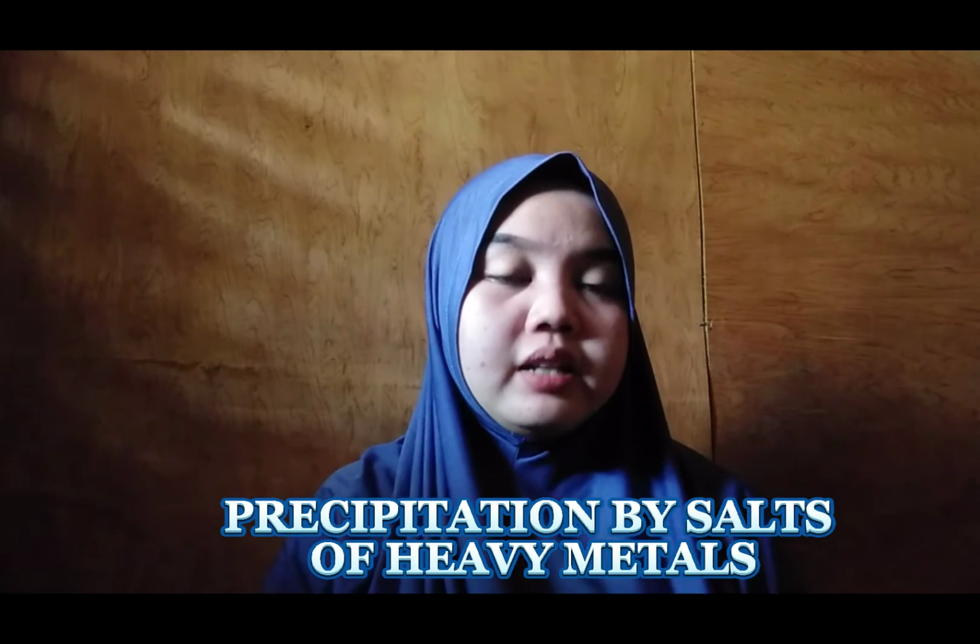Next is the precipitation by salts of heavy metals. We have two tests, the test for copper sulfate and lead acetate. Then give only your observation. Procedure: add egg white to the two test tubes, then add a saturated aqueous solution of copper sulfate to the first test tube. Then add an aqueous solution of lead acetate to the second test tube. Then observe the color that appeared in each test.